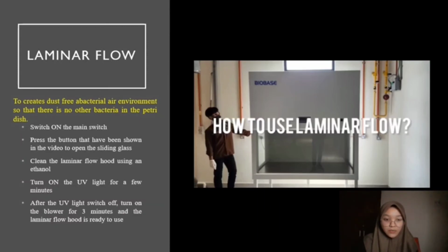Next, turn on the UV light for a few minutes. And after the UV light switches off, turn on the blower for 3 minutes and the laminar flow is ready to use. So this is the video so that you guys will be clear about how to use this equipment.